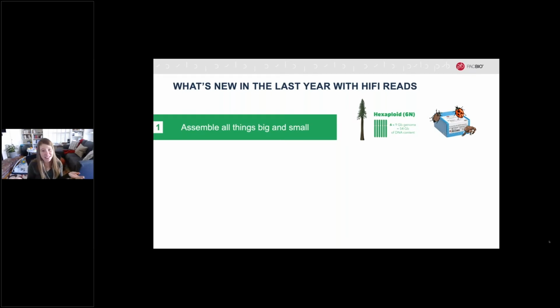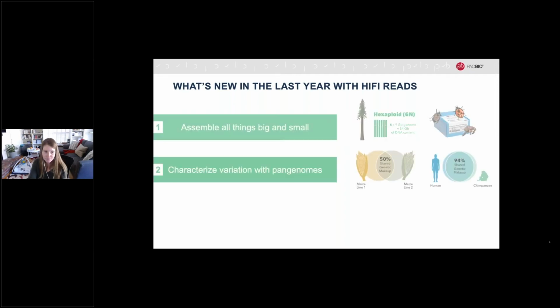And spoiler alert, later today, Liz Sang will be presenting on the IsoSeq data that then came out of it, and the ability to use isophase in order to phase the haplotypes. We also saw on the other end of the spectrum that we released the amplification-based ultra-low DNA input workflow, which really opens up the ability to make reference quality genome assemblies for really tiny arthropods. So that was really exciting. And there are several talks today focused on that work as well.